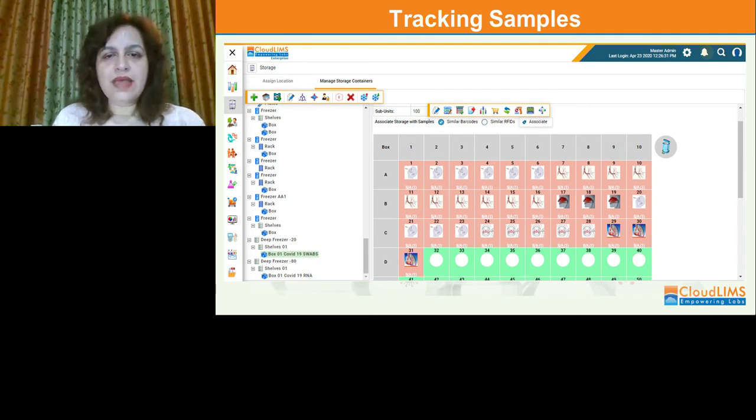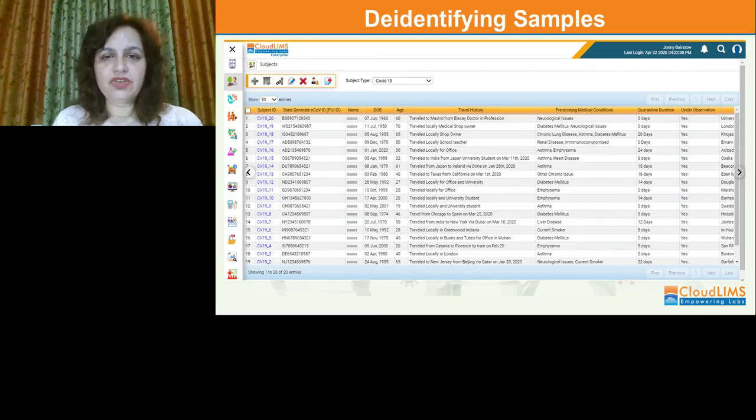We all know that sample data without patient information is incomplete. A LIMS maintains the patient's age, medical history, lifestyle details, comorbidities, which may help clinicians to raise a flag. So when a sample comes in, a LIMS enables the administrator to de-identify the sample by assigning an internal sample ID. And anonymization is a part of HIPAA.